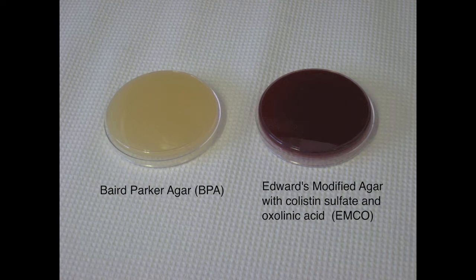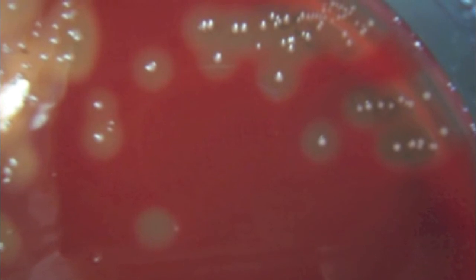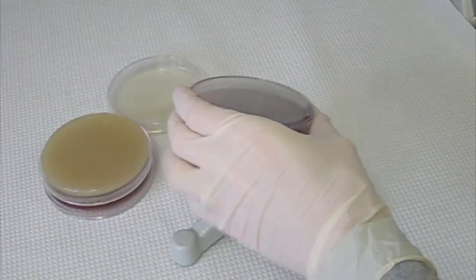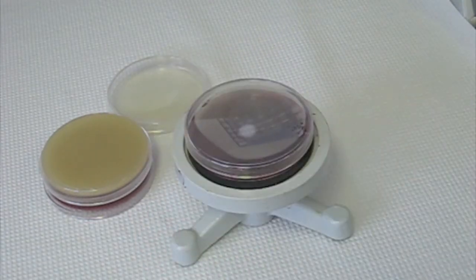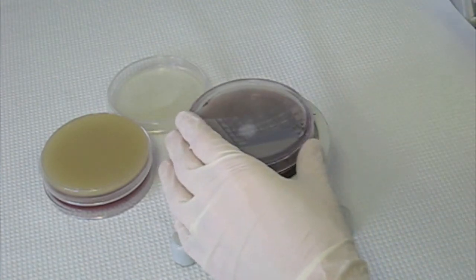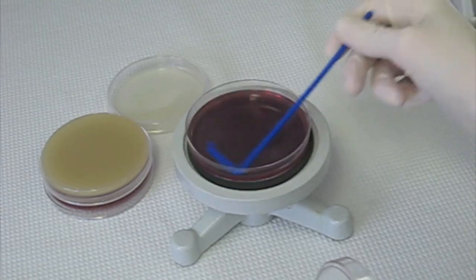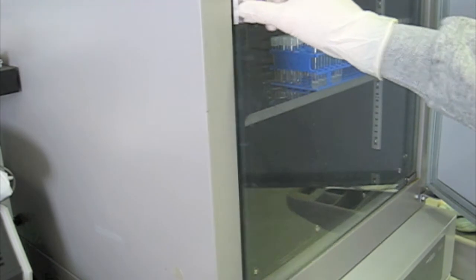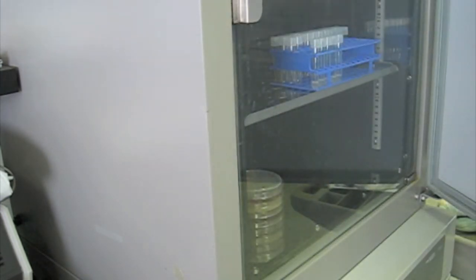Colonies that grow in these agars that look like they might be one of these contagious pathogens are isolated and identified by more rigorous biochemical tests. Once the media is selected, a predetermined amount of milk is added to the plate and spread out evenly to ensure there is a uniform layer. The plates and/or films are then incubated at 32 degrees Celsius for 2 days.